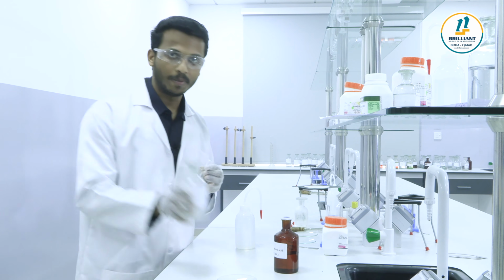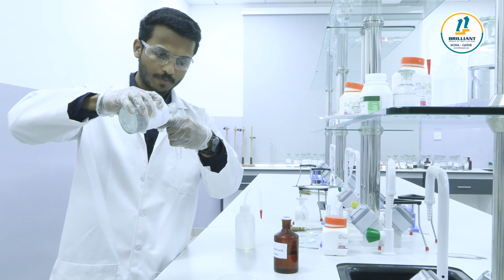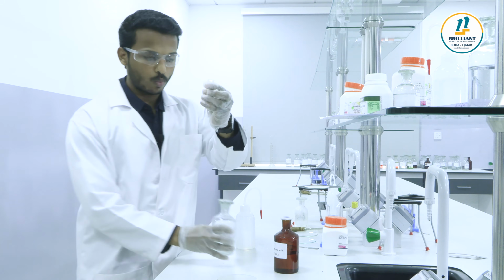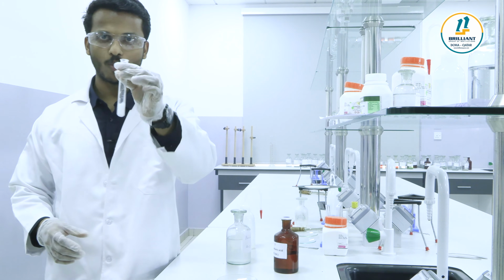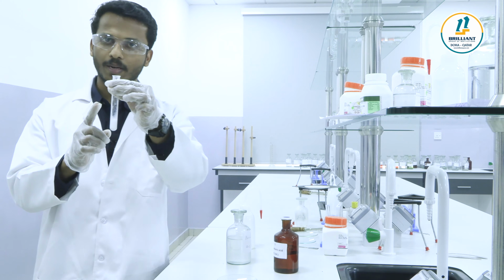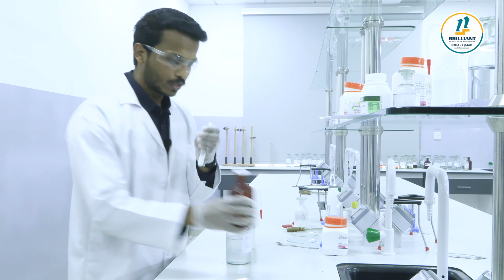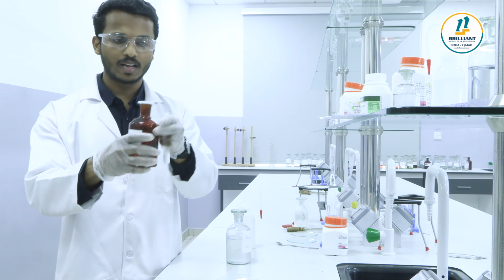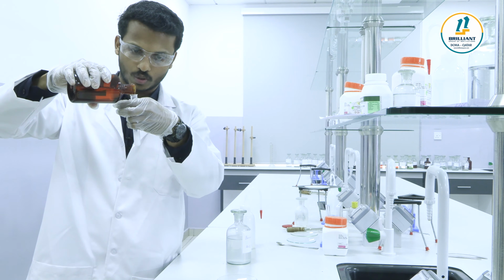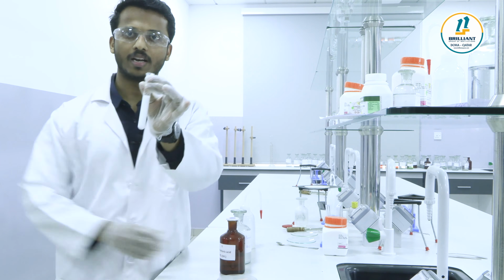So, let me take barium chloride solution. You can see a white precipitate formed, right? A white precipitate. The observation is that this white precipitate is insoluble when you add dilute HCl. So let me add dilute HCl. It should not dissolve. See, the white precipitate still remains.